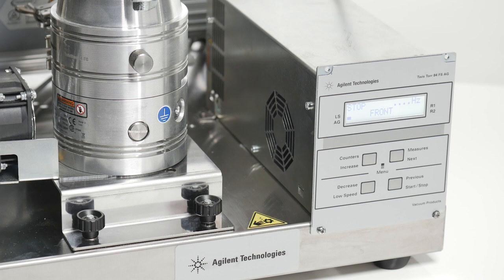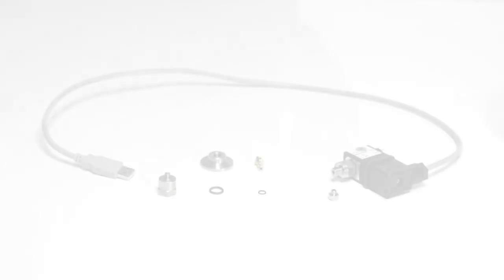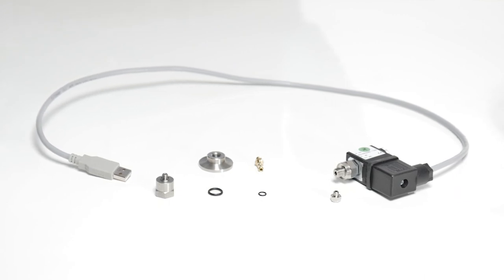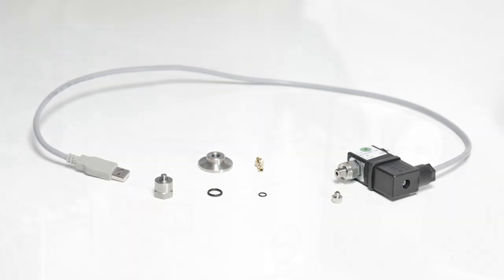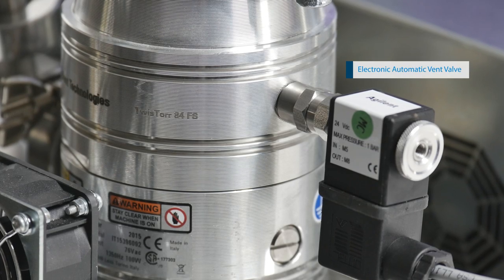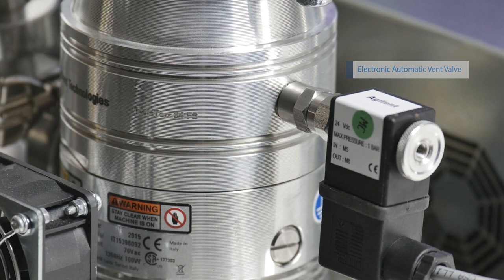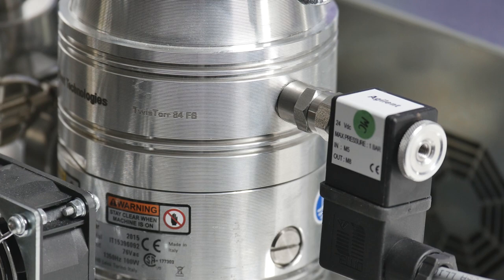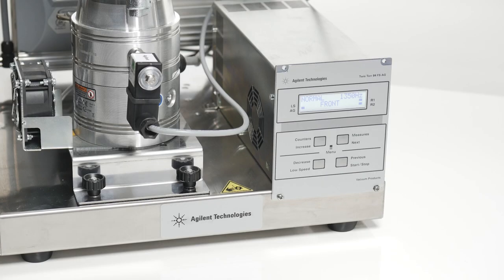The turbo pump is now stopped and we can power off safely. For customers who don't want room air entering their vacuum system, or who don't have hands-on access to the pump, or even those who simply want a more repeatable vent cycle, Agilent offers automated vent valves that connect to the turbo controllers and allow users to precisely tailor the vent sequence for their application.